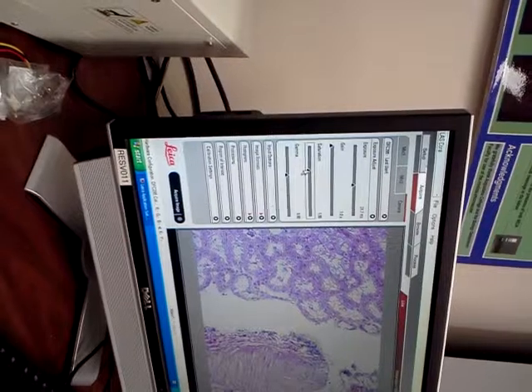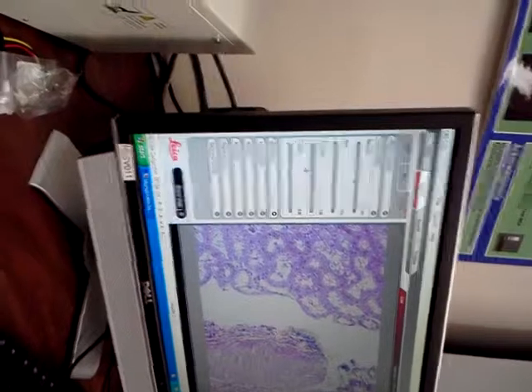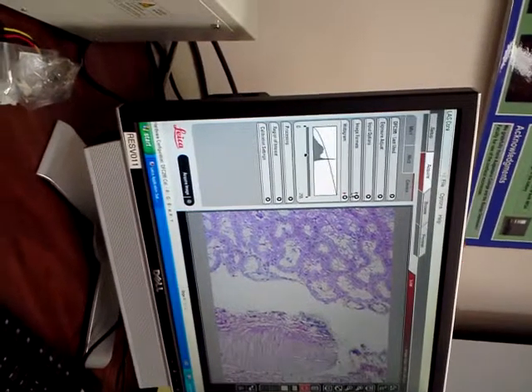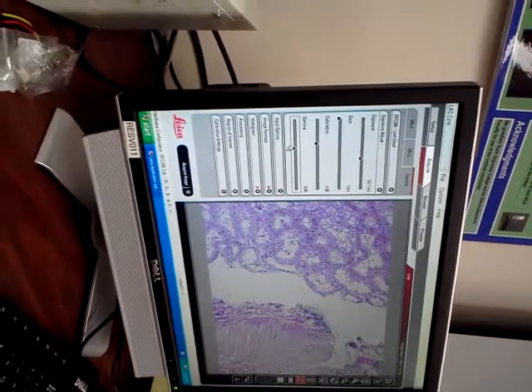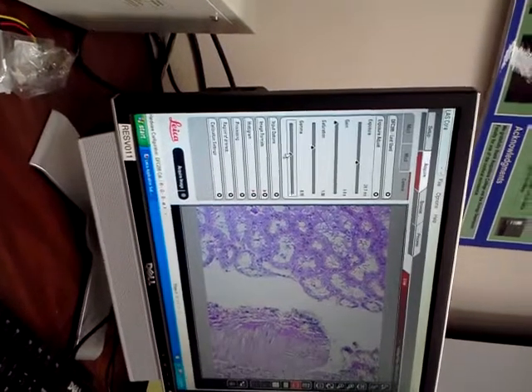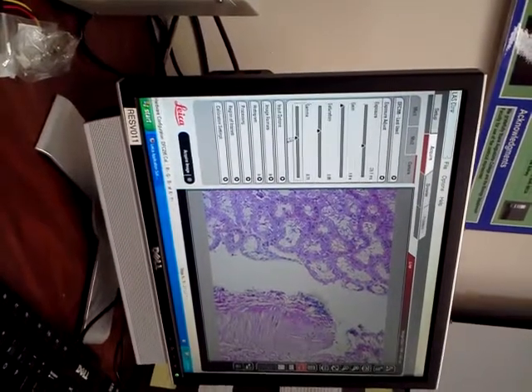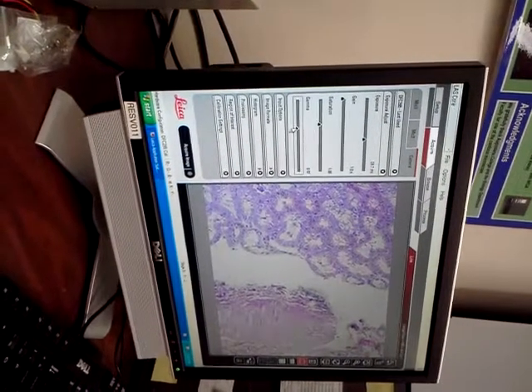What you want to do is try to match what you see through the scope, color-wise, right? And then your gamma just changes, obviously, your histogram, bows it up, it includes more information. I'm going to show you that too. I've never really understood gamma, though. You know what? I'd say just leave it at 0.6. That's the default for it. If you increase it, it's a little more contrasty, and it does play with your histogram a little bit. If you bring it down, it's going to get washed out. Okay. So 0.6 is the default, and I'd say just probably leave it there.